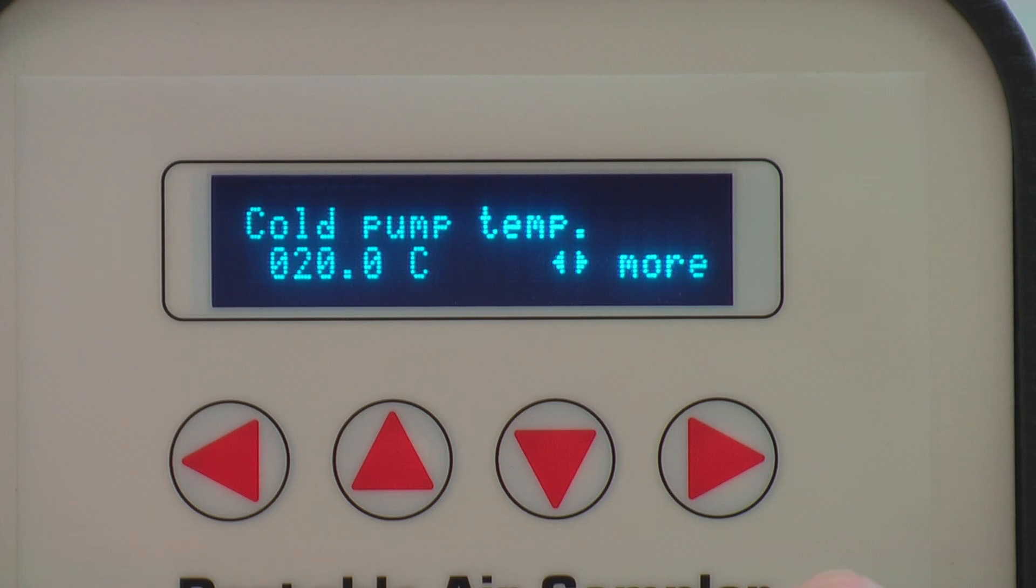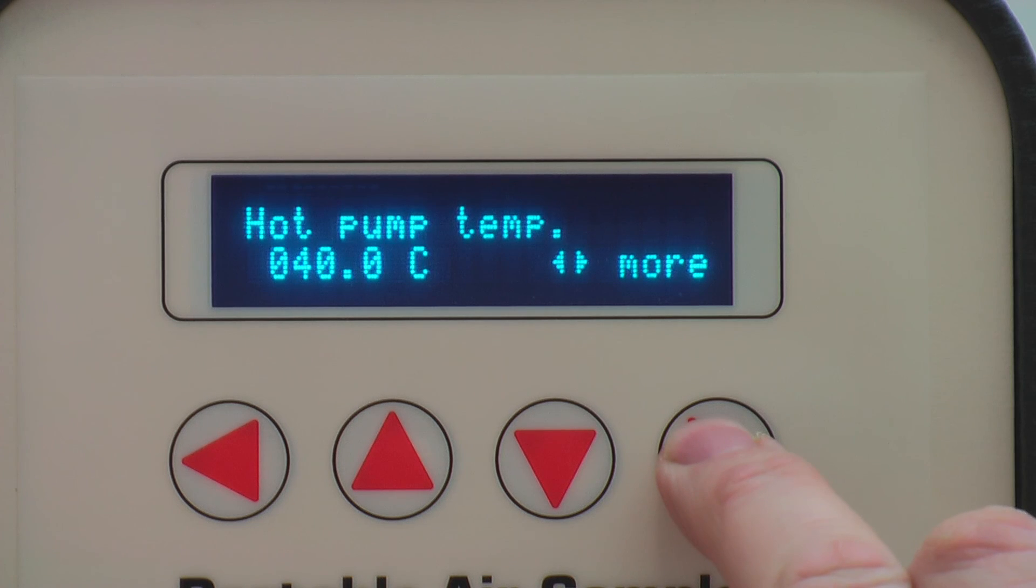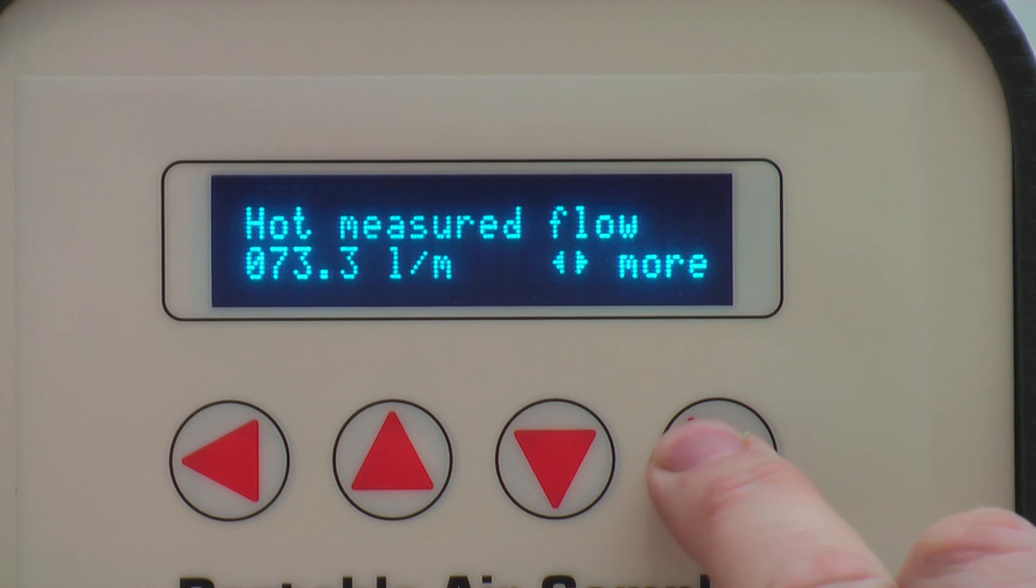Pressing down allows you to view pump diagnostics. Pressing the right arrow key will allow you to cycle through the different diagnostics. Pump diagnostics can be inspected by pressing the right arrow and cycling through until you reach cold pump temperature. All of this information is useful for your internal processing and calibration checks.